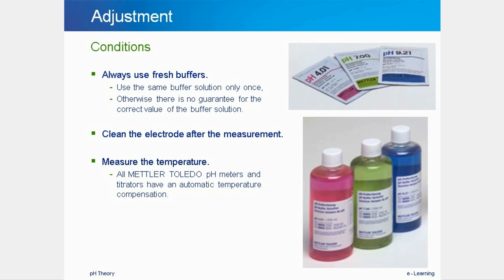After first use, there is no guarantee for the correct pH value of the buffer, as it is never certain what it has been contaminated with. When using a bottle for the buffer solution, always make sure to only pour solution out of the bottle and never back into it.